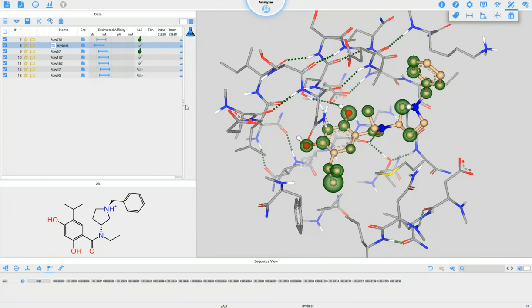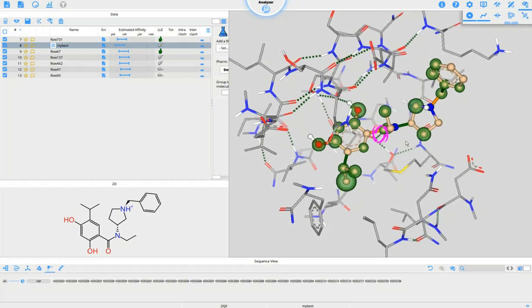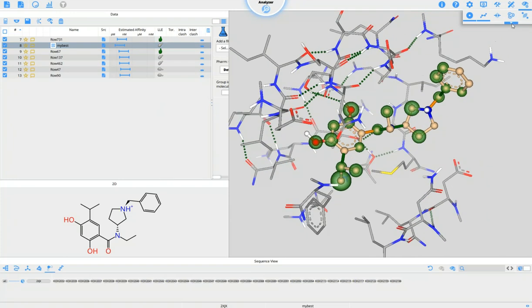You see here there are some columns about the torsion and the clashes. Torsions are of course very interesting. If a torsion angle is maybe unlikely, then you might not want to trust your docking results. On the visualization button here on the top right, I can toggle on the torsion coloring. You see now those torsions are color coded from green to red. And again, going to the label function, I can get a label and color those torsions.